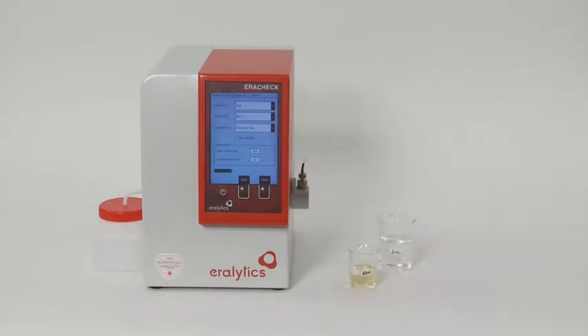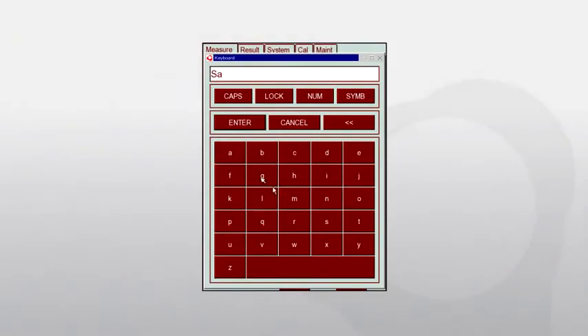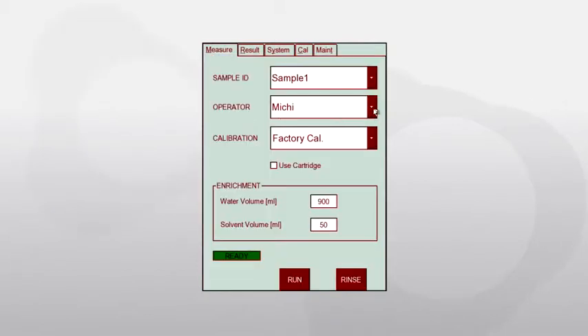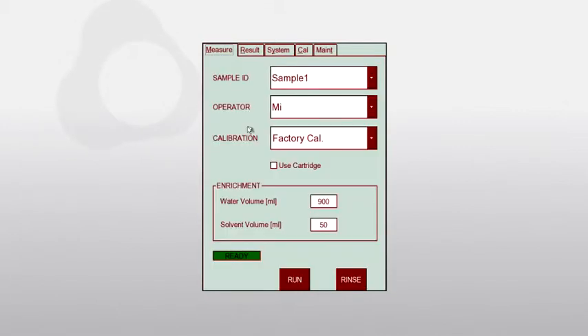Use the delivered glass syringe to transfer approximately 20 millilitres of the top layer into a beaker glass. The extracted sample is now ready for automatic analysis. Enter the sample ID and the operator on the pop-up keyboard or select them from the drop-down list, then enter the exact values for the water volume and solvent volume used for the extraction — we recommend 900 millilitres water and 50 millilitres solvent.